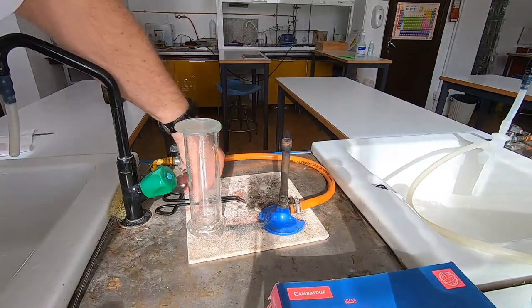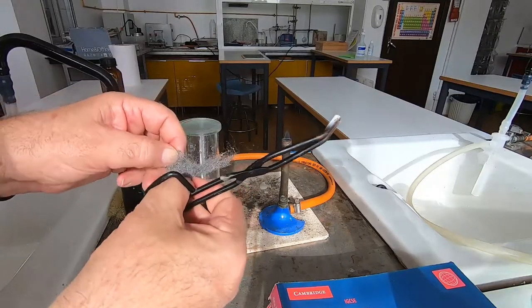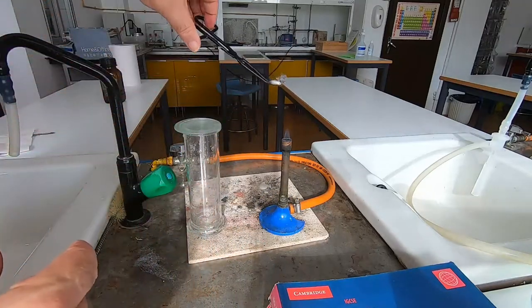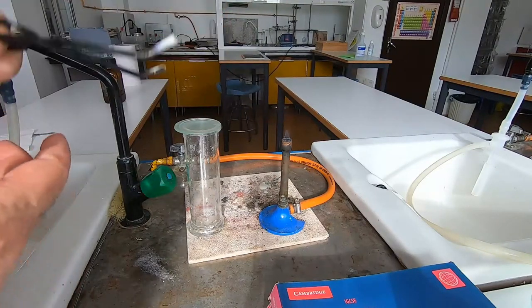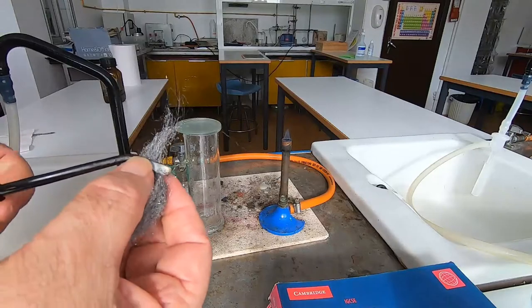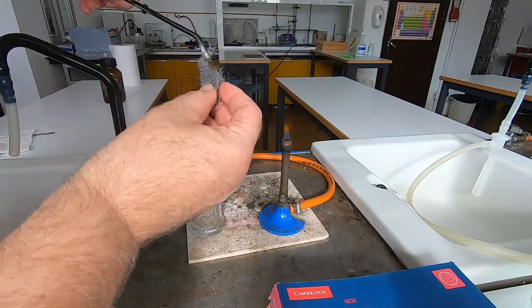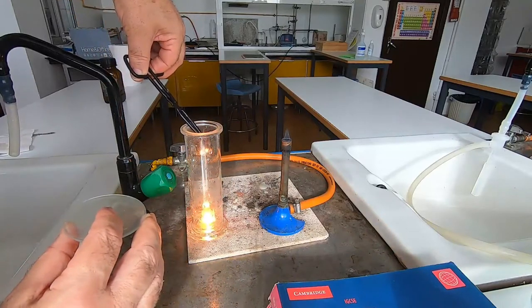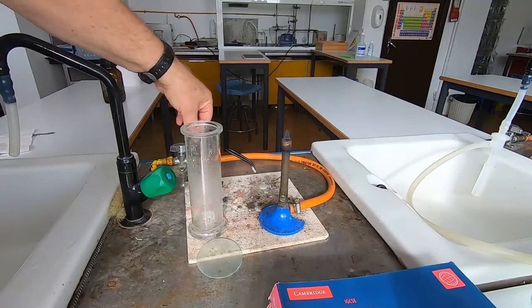Now we're going to look at steel wool and see how it burns in oxygen. Just to remind you what it looks like when it burns in air — you can see how it sparkles and burns a little bit. Now let's try the same steel wool plunged into oxygen. Here it is glowing — put it into the oxygen, and we can see it burns very, very brightly. Really, really hot in there.